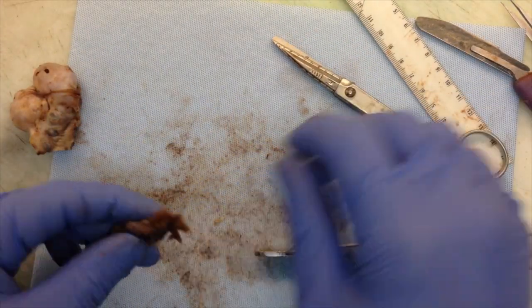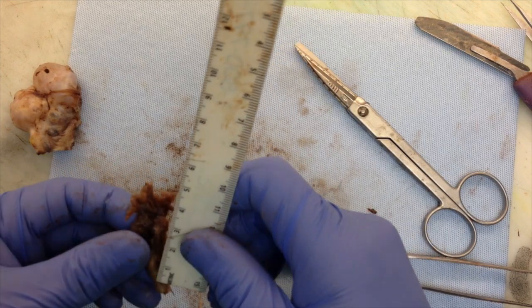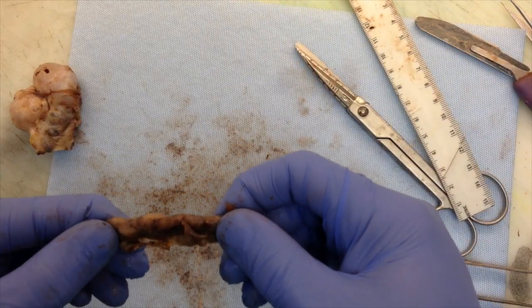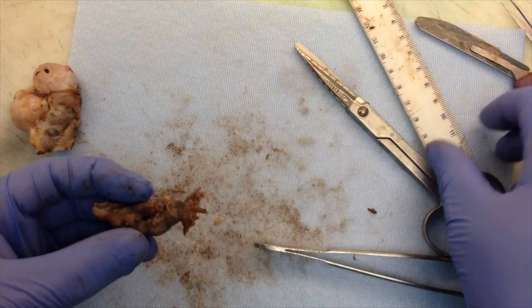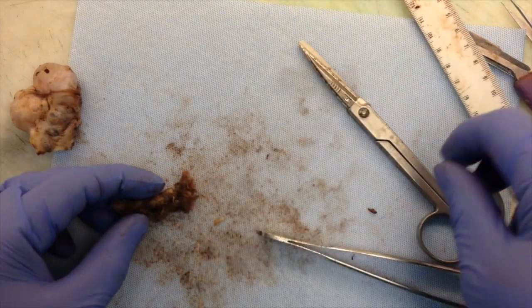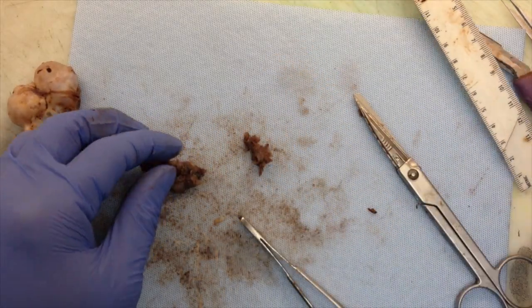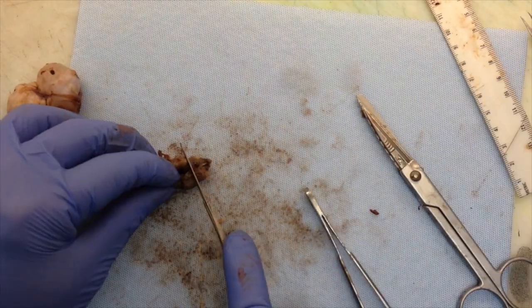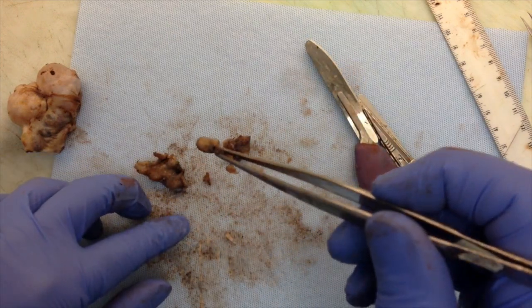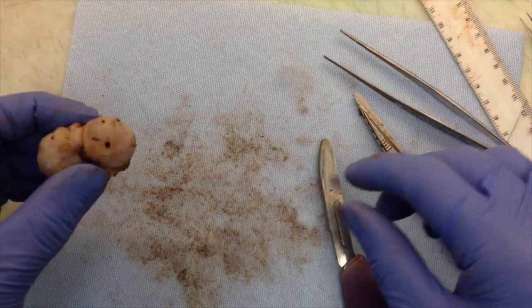New paragraph. Attached is a fimbriated left fallopian tube (4.0 cm in length by 0.5 cm in diameter). The surface is tan-brown and remarkable for multiple peritubal cysts ranging from less than 0.1 to 0.5 cm in greatest dimension. So we just amputate the fimbriated end and just kind of serially section it, and then I described these paratubal cysts, so I'm going to demonstrate it. Cut right across them, and so here's the cut lumen of the tube. Cut sections demonstrate an unremarkable lumen.